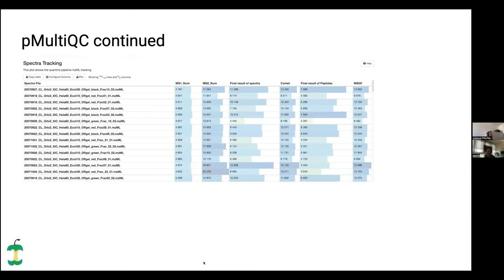Then some more detailed information about specific samples — for example, the number of spectra on each level, like fragment spectra or survey spectra, how many of them were identified by each of the search engines, and how many were identified after ConsensusID.